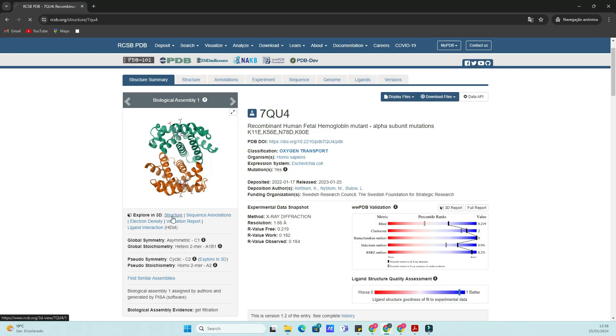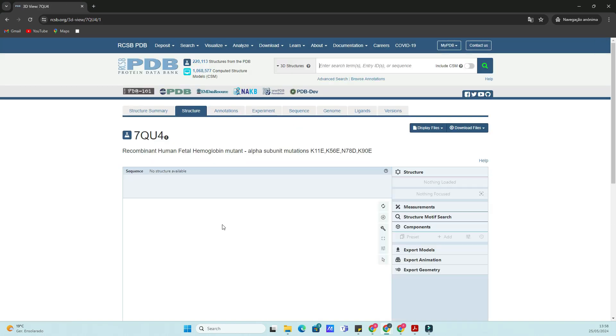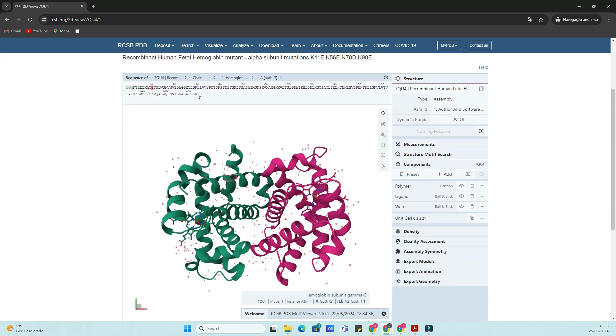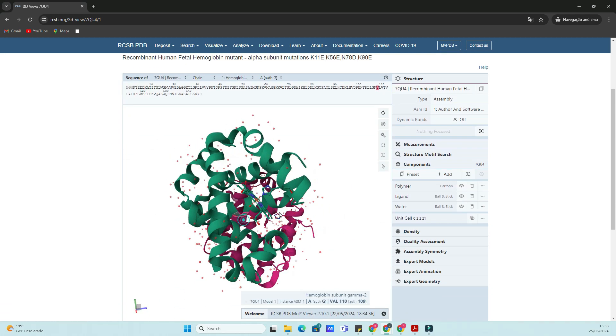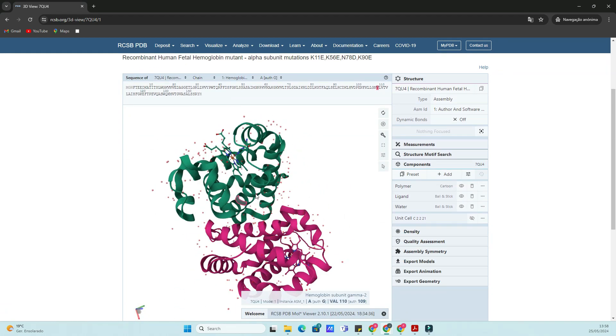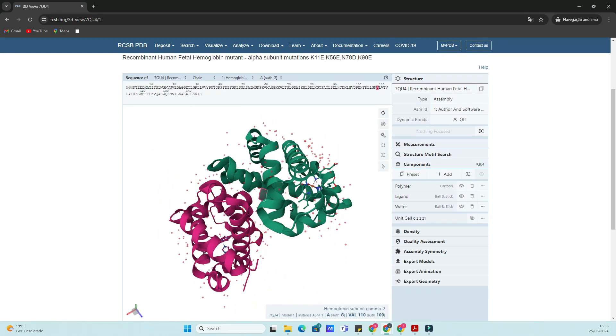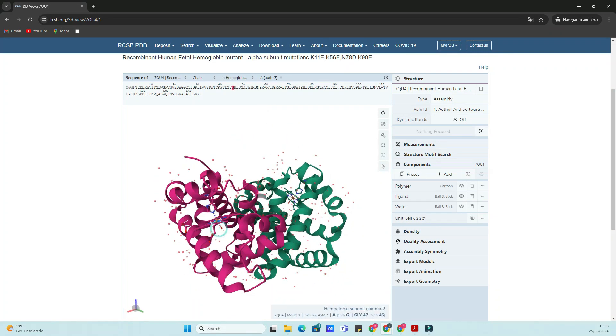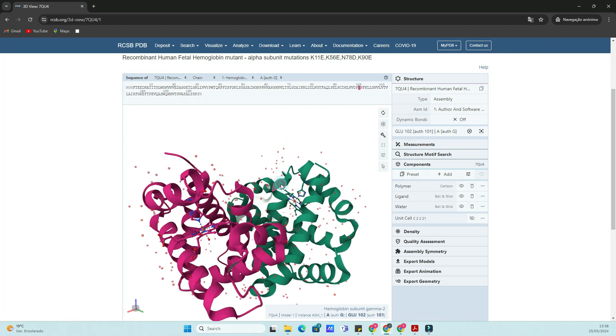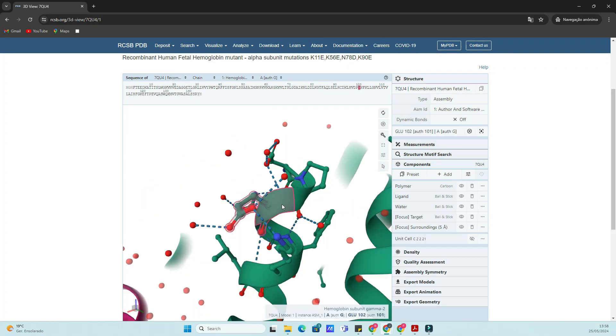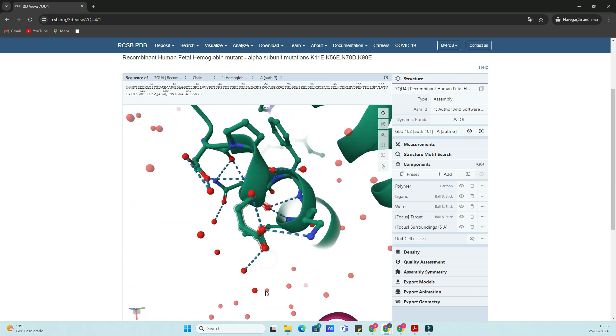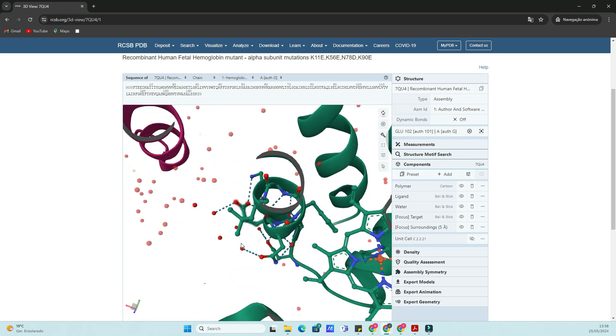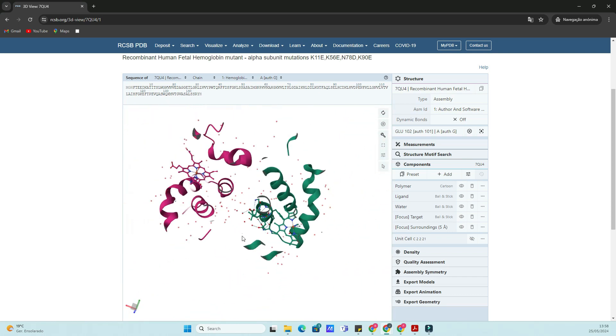Here, we have the detailed view of the hemoglobin structure. You can see various tabs like Summary, 3D View, and Sequence. The Summary tab gives you an overview of the structure, including the method used to determine it, resolution, and source organism.